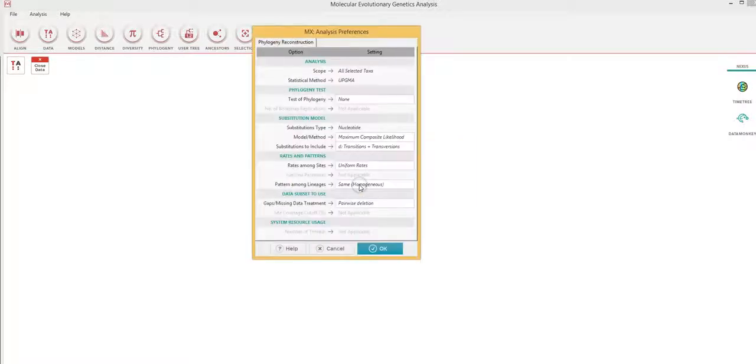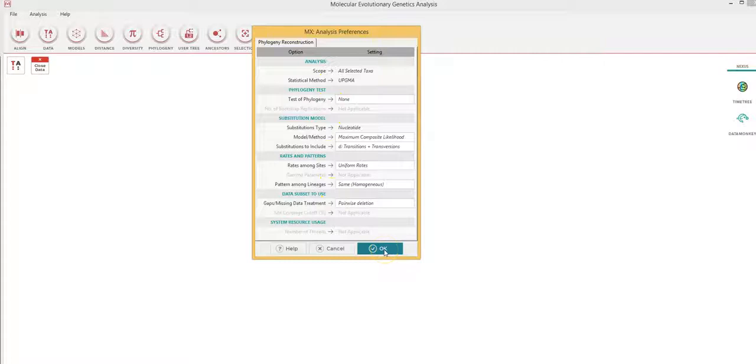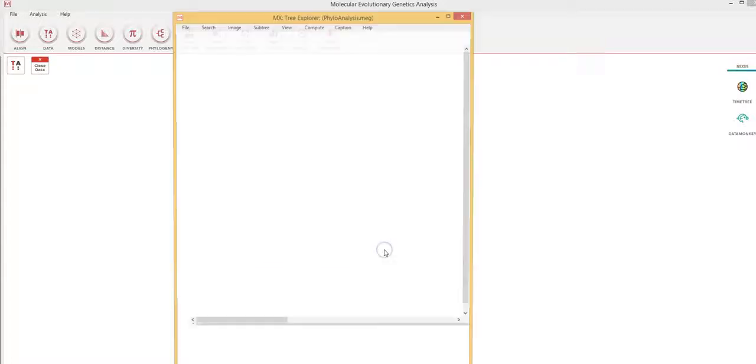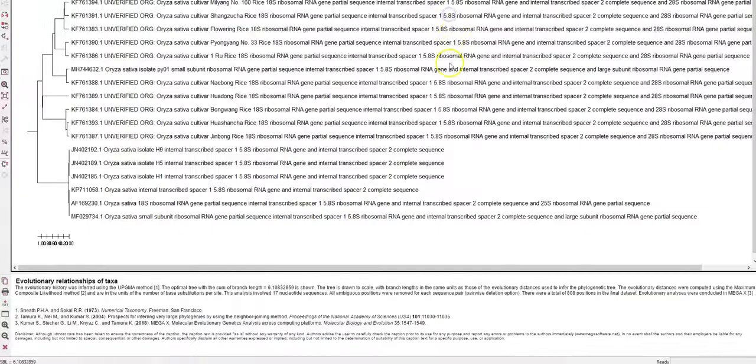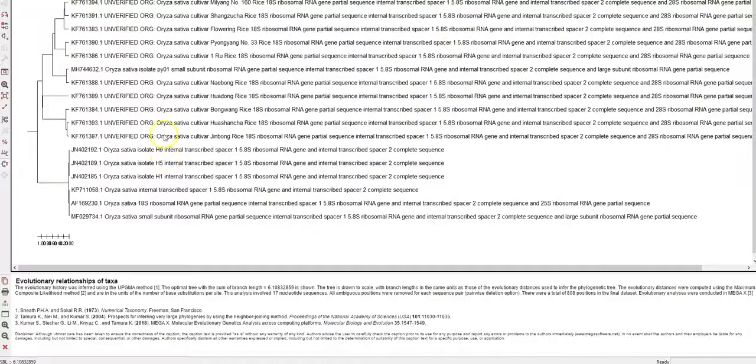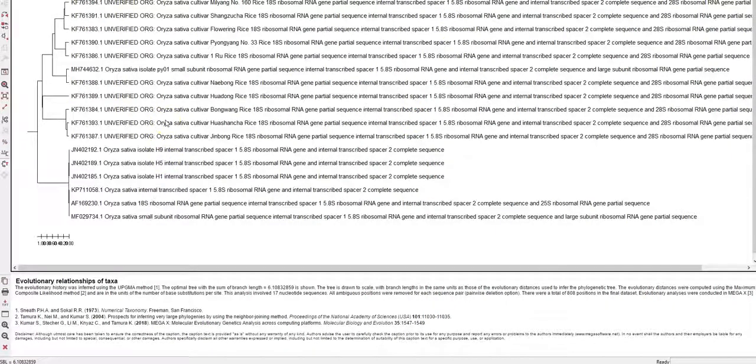So click yes and these are the defaults and you should be okay. You click okay for this example. Now this is the phylogenetic tree which has been constructed using this software.